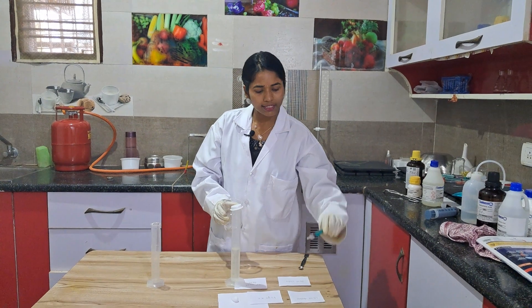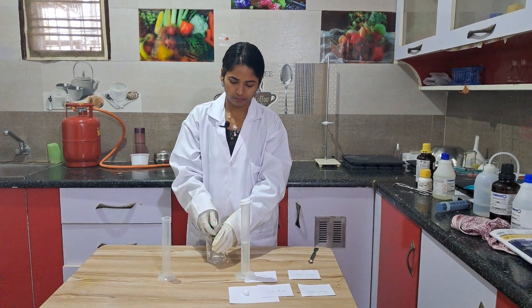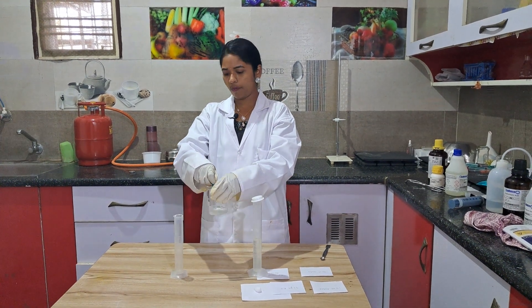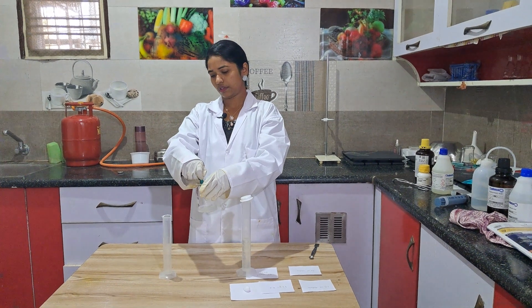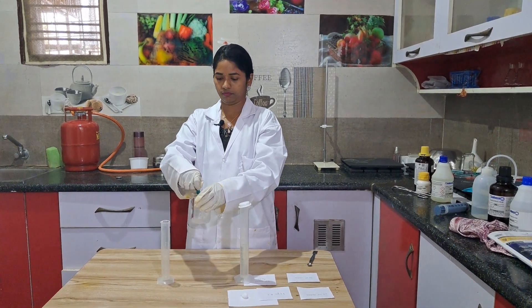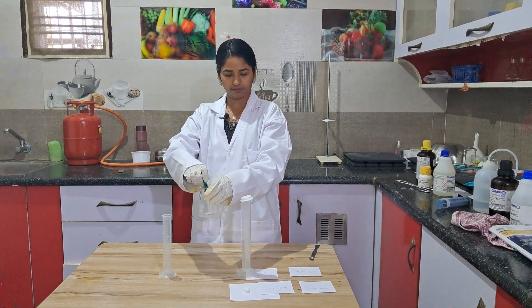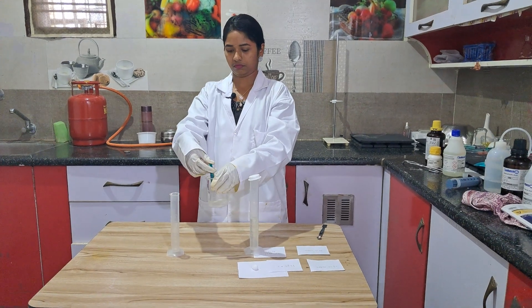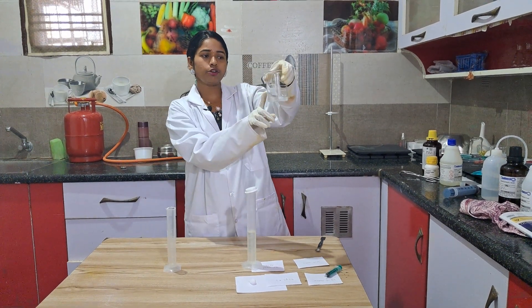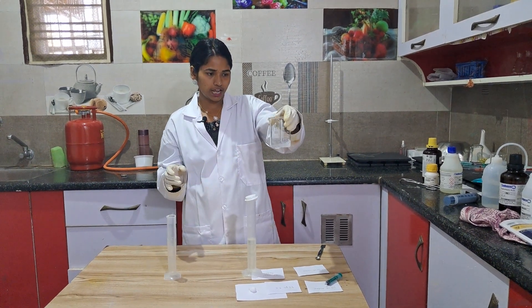Now I am going to add 1.5 ml of acetone into this — adding drop wise and shaking. This is the acetone solution: 1.5 ml of acetone in 30 ml of water. Shake well.